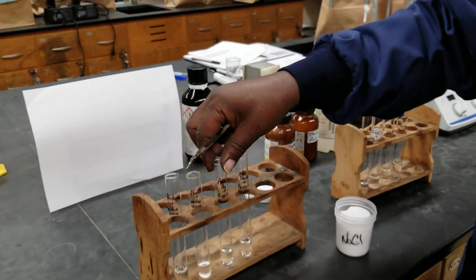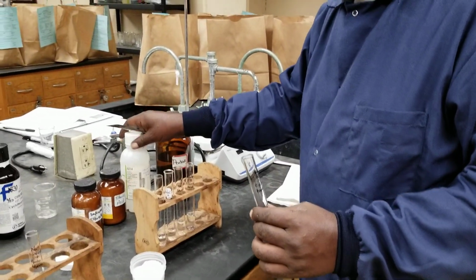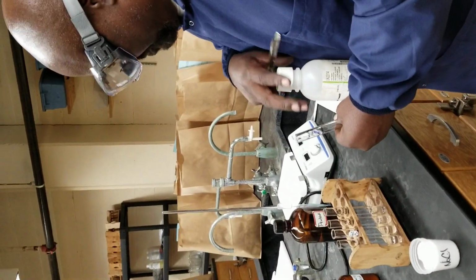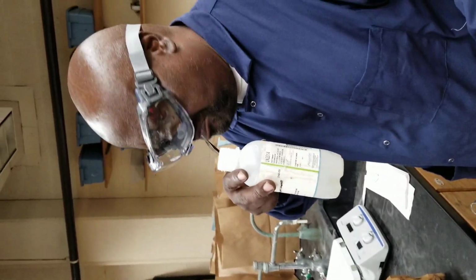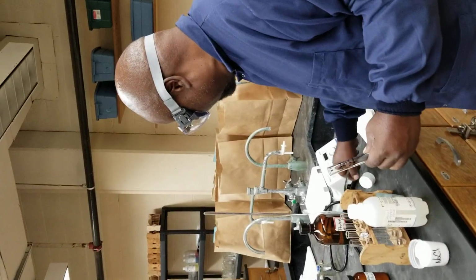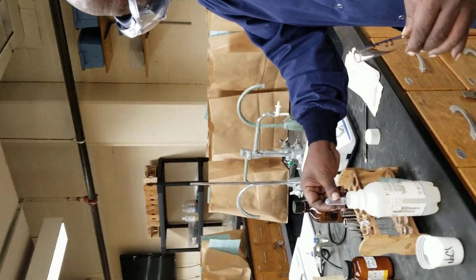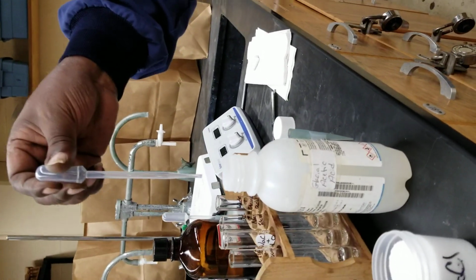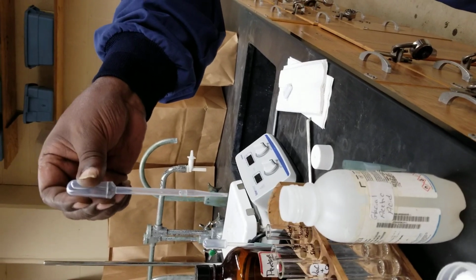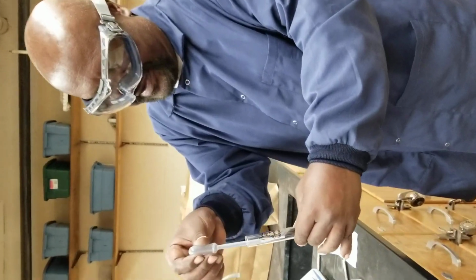Moving along, my friends, pure acetic acid. People refer to it as glacial acetic acid. Smells like vinegar. Well, the active ingredient in vinegar is acetic acid, as you very well know. We take some here. You'll notice acetic acid is not dripping, except when I'm pressing it. Five or six drops, even more.